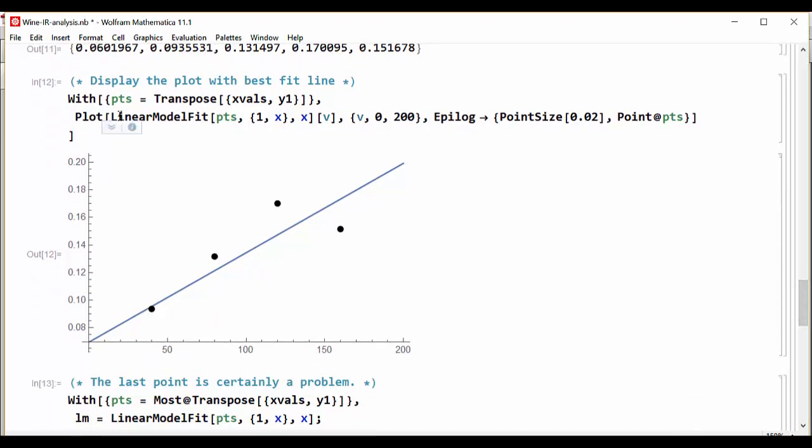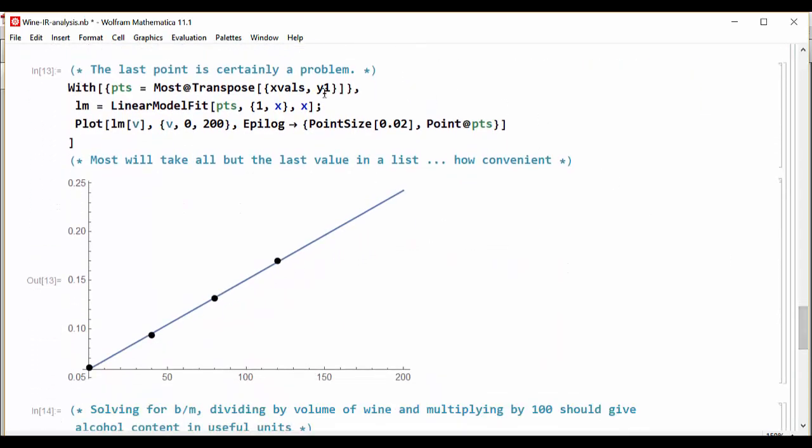When we plot this along with the linear model, we see that that fifth point is causing some troubles. The first point is actually not on this screen. So it's clearly an issue and so that needs to be removed. Fortunately it's the very last point, and so we can make a Mathematica trick here where we use the most command, and that chooses all of the data in a list except for the last one.